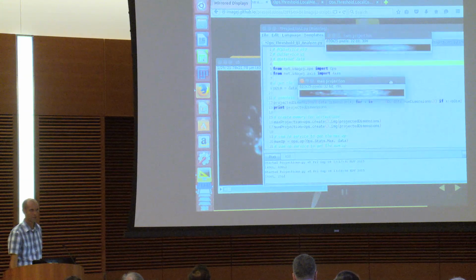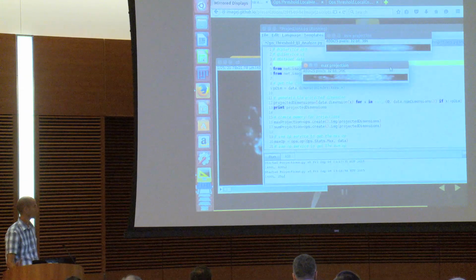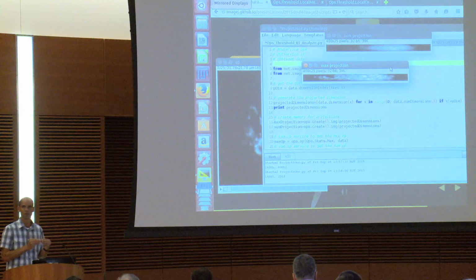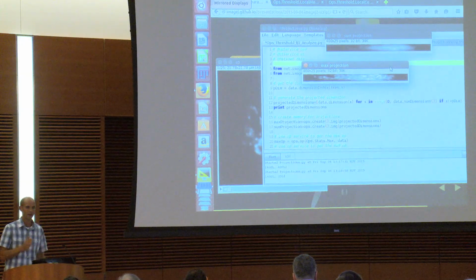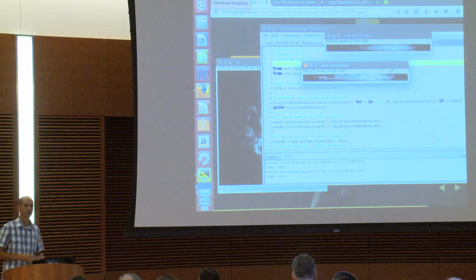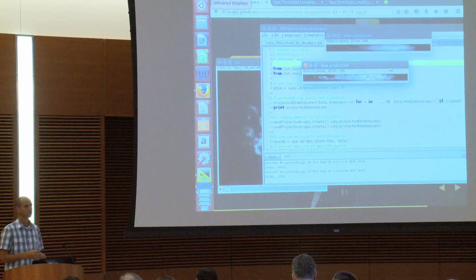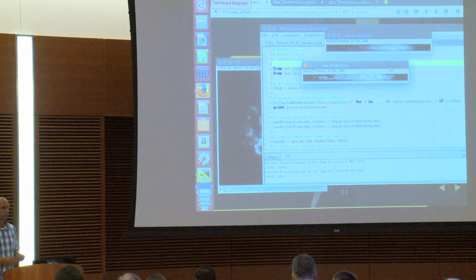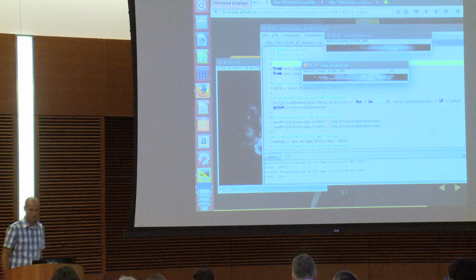and this time we get the sort of axial projections, and those are similar to the images I was showing in the deconvolution presentation when I was looking at data along the third axis. And this is, especially for stuff like deconvolution, really, really important because, as I mentioned in that presentation, everything often works really great in X and Y. And if you just look at your X and Y, you think everything's okay. And then as soon as you look at your third dimension, you realize that there might be artifacts, or you might not have the really good reconstruction along that axis.